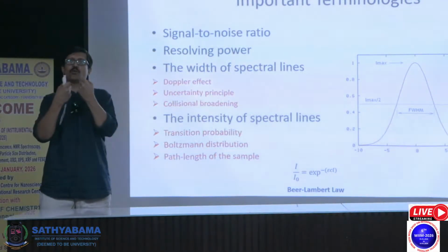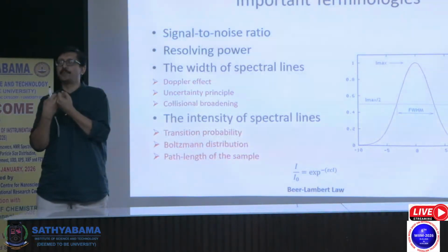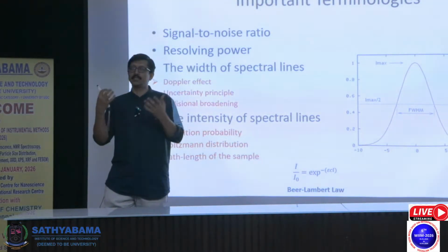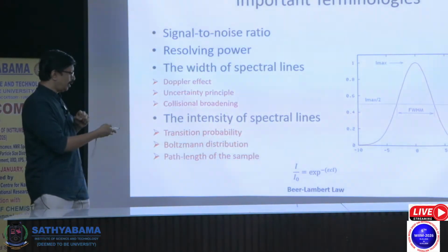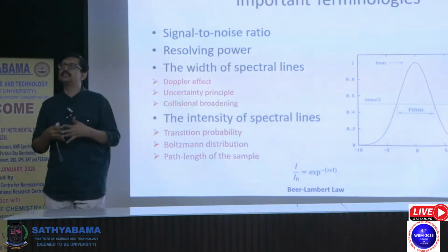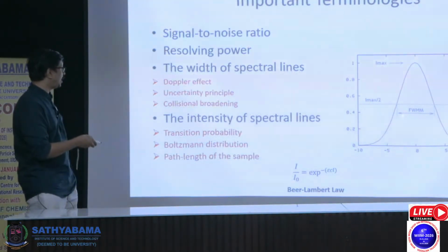These electrons, when they try to collide, see, whenever molecules interact, there are only two types of energies, attraction and repulsion, right? Electron, same charges will repel, opposite charge will attract. So electron, when they come close, they repel each other. As a result of this repulsion attraction, there can be variation in the electronic energies. And that can lead to the scattering of energy, which is the broadening part. The more broad means more energy. So spectral broadening is one aspect that you need to consider while measuring the UV absorption.